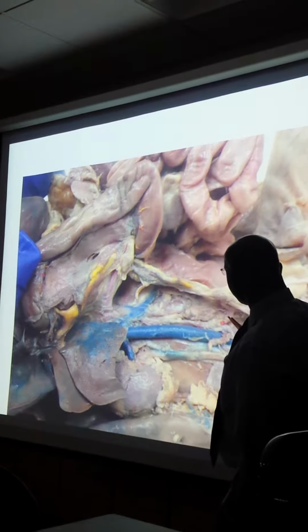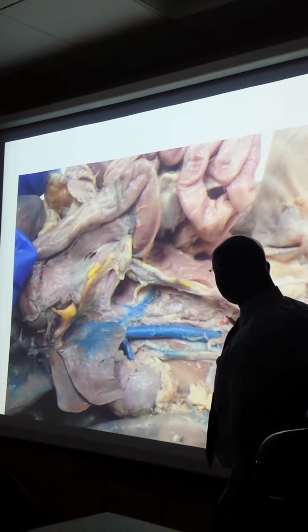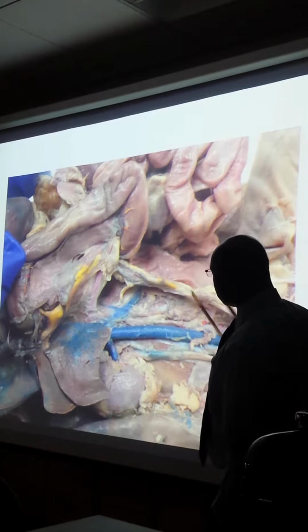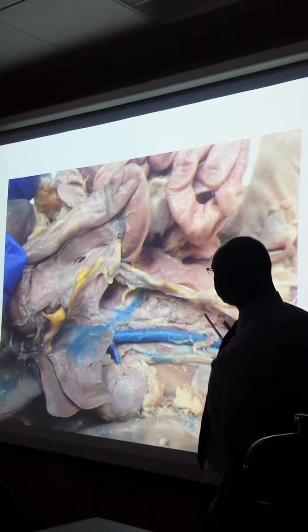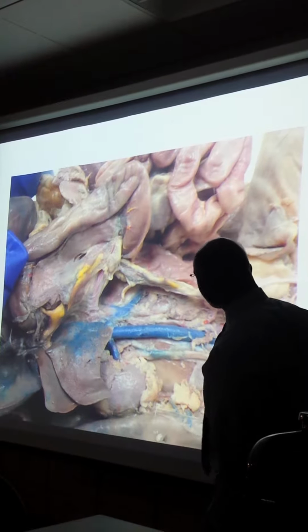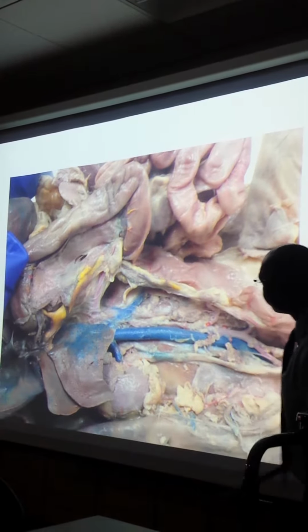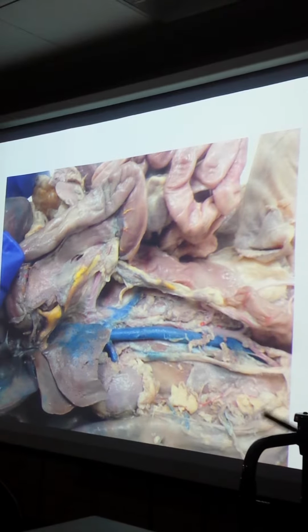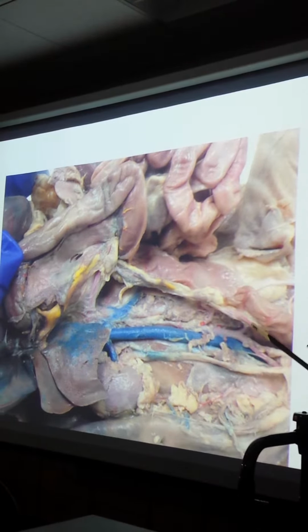And this is the inferior mesenteric artery. See what I'm saying? This one here, the one that's kind of squiggly like that. All right? But there's another better picture that shows it nicely. Okay? And then this is probably going to the adrenal gland. Okay? But there's another better picture again for that.